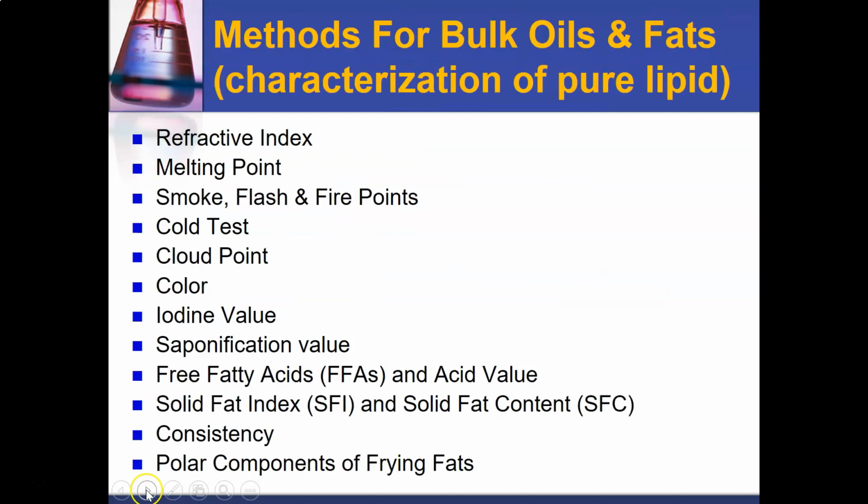So this is the list, not complete, but the list of analyses that you can do for pure lipid. This one you cannot do on a food sample, but you have to do on pure lipid, or we call it bulk oils and fats. Okay, so mainly you are just analyzing the pure lipid, nothing else in there, just lipid.